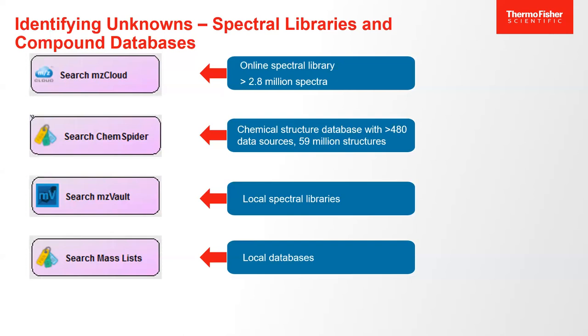Don't worry, Thermo appreciates you. What you're going to do is pick one compound that's in our spectral library and run it on the QTOF under the conditions the QTOF says are default. Then you search that against mzCloud, and you say, oh, QTOF basic is 40 electron volts on the Orbi. Now you know how to run all your QTOF data through mzCloud, because you know the conversion factor from the QTOF world to the Thermo world.